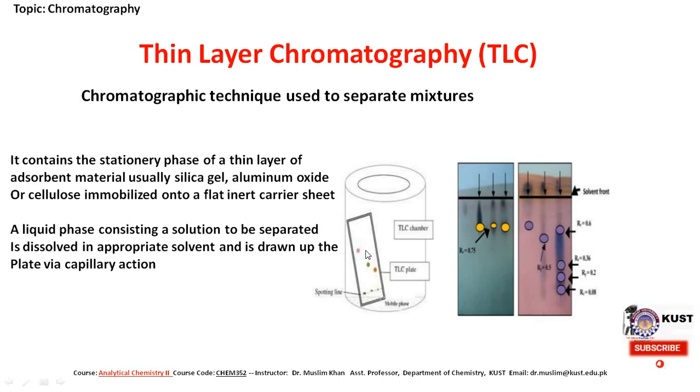Then the mixture is spread uniformly as a thick slurry on the plate, usually a glass plate.